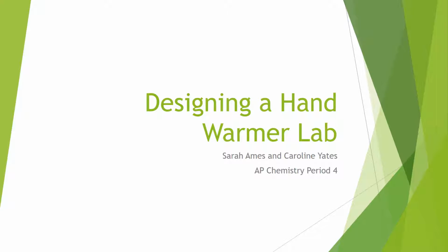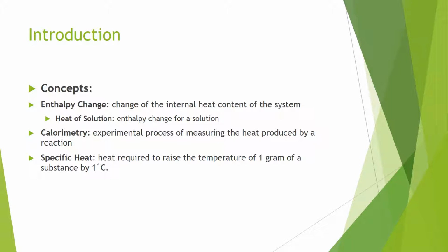This is our project on designing a hand warmer. The concepts applied in this lab are enthalpy change, calorimetry, heat of solution, specific heat, exothermic and endothermic reactions, and systems and surroundings. Enthalpy change is the change of the internal heat content of the system. Heat of solution means the same thing but applies specifically to solutions.